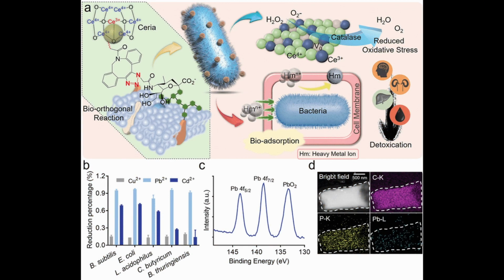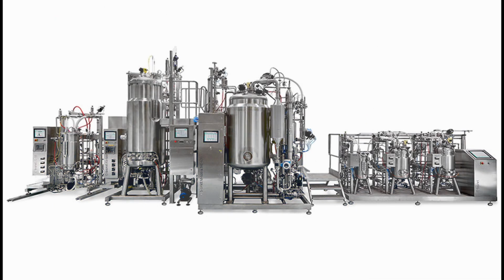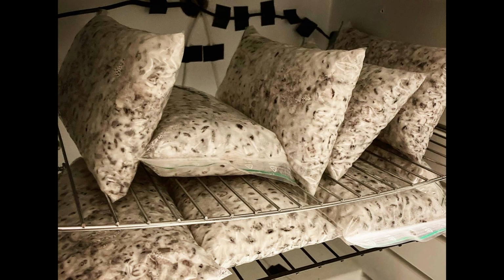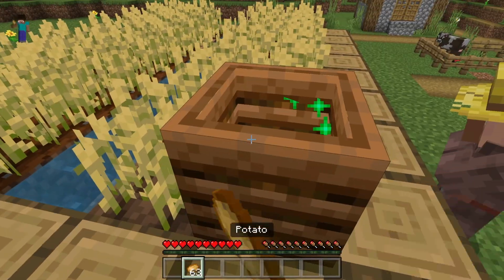Then, when I say enzymes and biomass, these are scientific terms. You might be thinking of something more like this. Oh, quite grandiose, isn't it? Well, yeah, but also, not only that, you're forgetting about the simpler stuff. Things like this. Yes! The humble solid state bioreactor, or a bed bioreactor. Well, they sound fancy, but looking at it, it's just a composter.